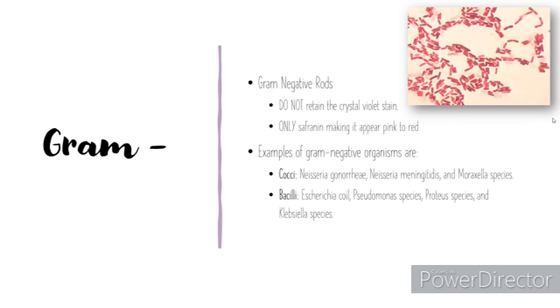They don't retain crystal violet stain, and they only soak in the safranin based on the time it takes to decolorize. So it will appear pink to red, and I also grabbed this image from the internet. So good representation.